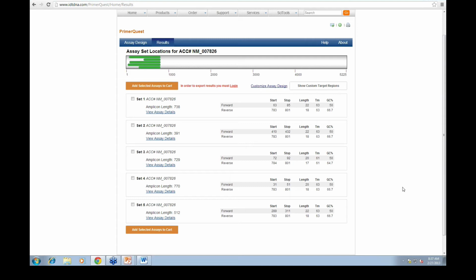That's kind of a difficult question. It kind of depends what type of assay you prefer to have for a genotyping assay. So typically with genotyping assays, the reason you're using them is you want to differentiate between a SNP, or a single nucleotide polymorphism. So a lot of times for genotyping assays, there's a couple of ways that you can distinguish between them.